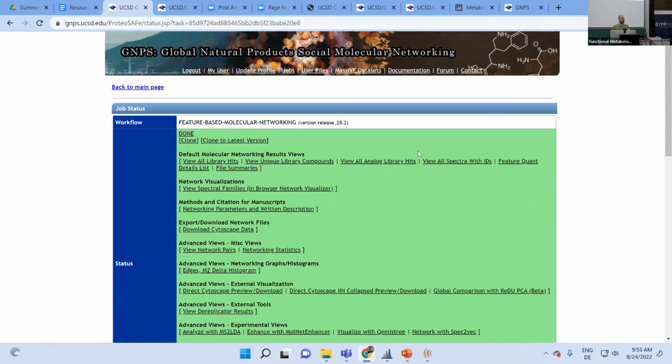Obviously, depending on your data set, that FDR goes up and down. There was variance: for some, the 5% FDR level was lower, for others, it was higher. That also depends a little bit on your instrument and on the complexity and quality of the spectra you have. Of course, we usually combine it with some statistical analysis to prioritize some of the nodes.